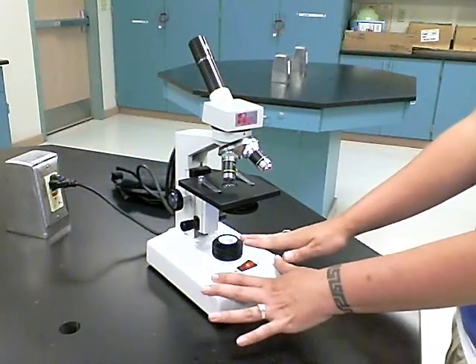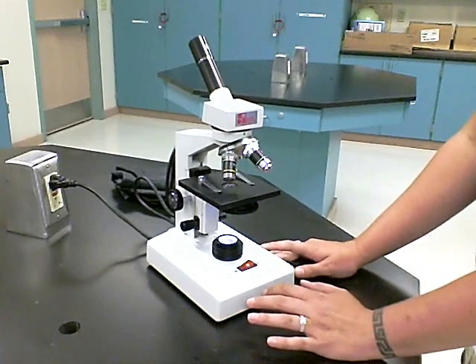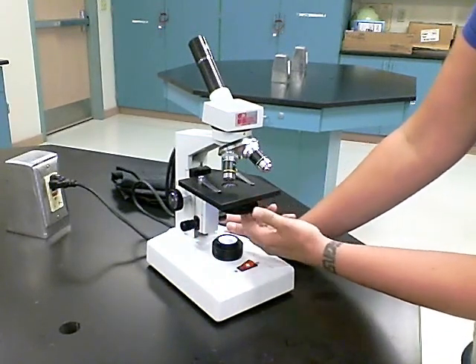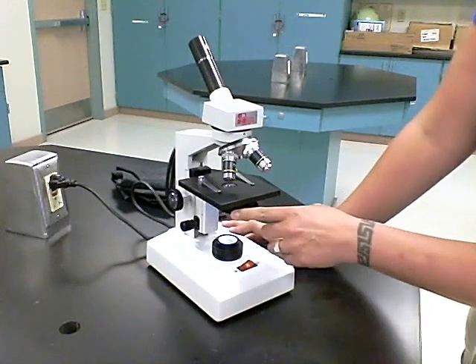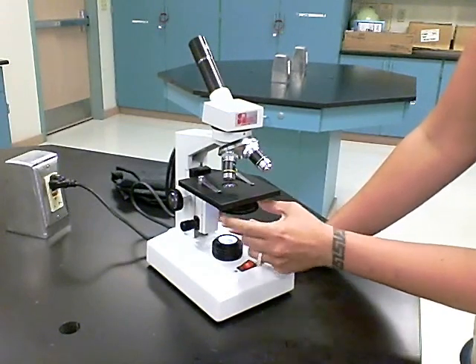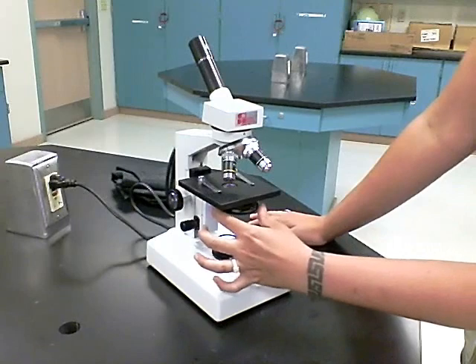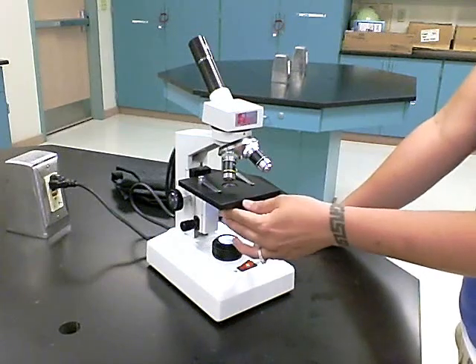So once your light source is on, what it does is it shines light through the condenser lens onto the specimen. And you can control the intensity of the light using the diaphragm, which is located right here below the condenser lens. What this does is it controls the intensity of the light that is focused on the specimen. At lower magnifications, you want a lower amount of light. As you increase your magnification, you want to turn this diaphragm to where you see this circle getting larger and larger, meaning you're getting more light focused through that condenser lens. When you're on your highest magnification, you want to be on the highest intensity of light so that you can get the highest resolution available.